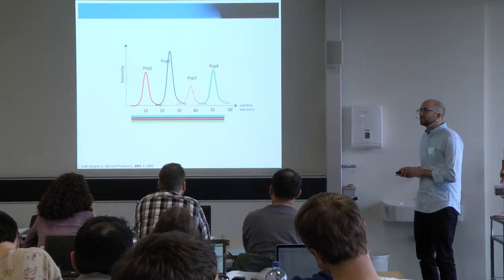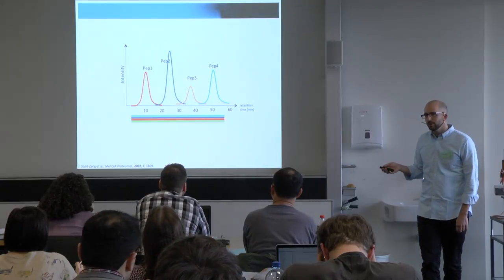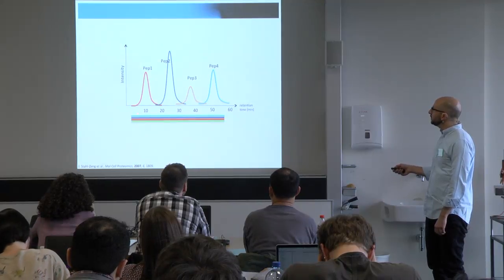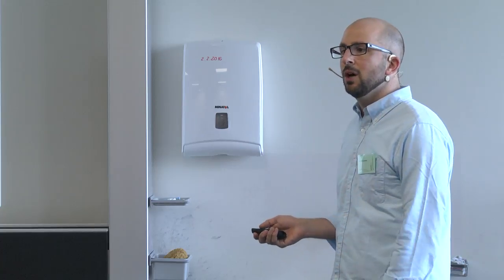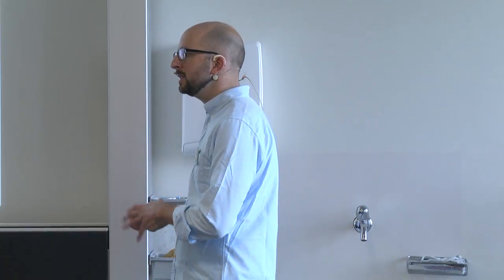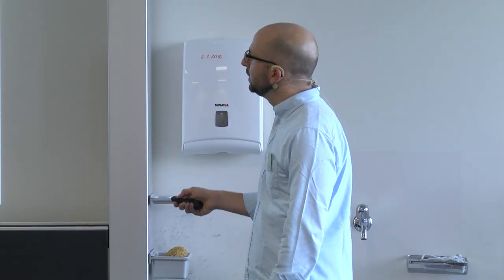So scheduling, as we've mentioned in the first lecture, is, and this is again a schematic representation. At the beginning we were measuring, let's say each color matches a certain peptide. Let's say 1 transitions that we measured. Of course we should have more, but in this case we've been measuring transitions for these 4 peptides along the whole chromatogram. But if we have some information that this peptide comes around this time and this peptide comes around this time, there is actually no point of measuring transitions for this peptide over here in time, or measuring transitions for this peptide over here in time. So we could actually tell the machines, we have some information about when do we expect this peptide, and according to this we want to start to trigger the measurement of these transitions for these peptides. So we could divide this into several segments and then measure certain transitions at certain times. And what you see here immediately is, instead of measuring 4 transitions, now we're measuring only 1, so we immediately gain in sensitivity.